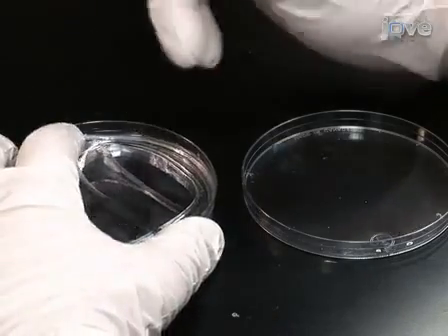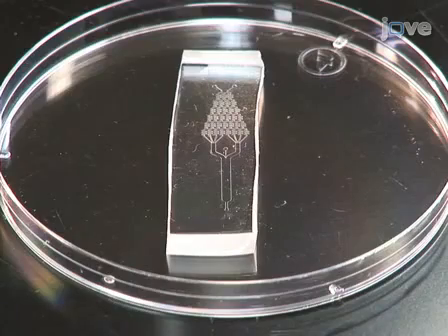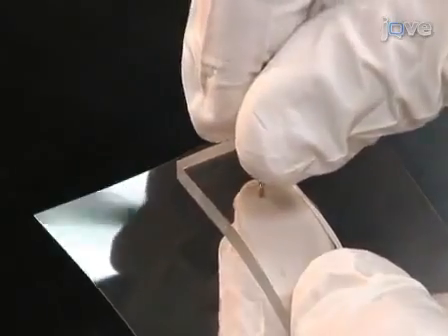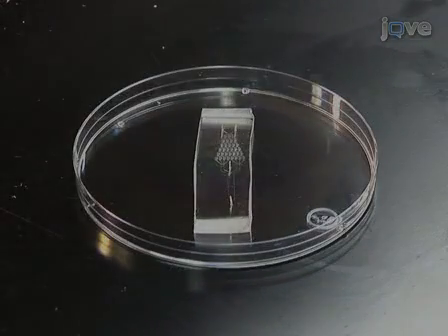After 2 hours, remove the cured PDMS-covered SU8 master from the hot plate and peel the PDMS mold from the SU8 master. The desired structure will be embedded in the PDMS mold. Using a 20-gauge blunt end needle, punch 4 holes in the PDMS mold for tubing to the gradient generator, cell inlet, and cell outlet. Now we are ready to assemble the PDMS device.